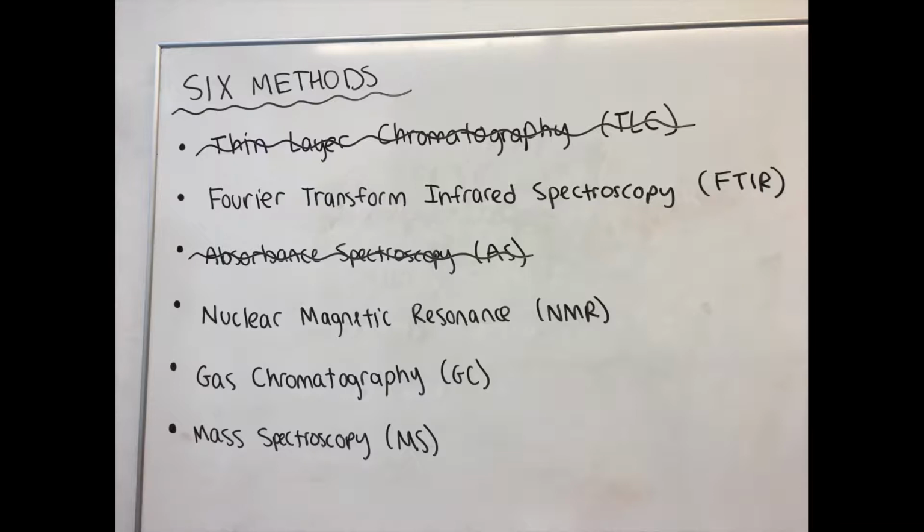AS is observed on an absorbance spectrum that shows the differentiating characteristics of the lambda max, or the wavelength at which molecules absorb the most photons. This can tell us how much and what types of electromagnetic radiation are absorbed because each substance generally has its own specific lambda max. It also is more quantitative than FTIR because it distinguishes between the lambda maxes of multiple substances within a mixture. However, we did not use this method for identification because we were not concerned with what wavelengths are absorbed by our substance, as this would not help in determining the structure of our molecule. Once again, we also already knew that we had a pure substance, so there's no need to distinguish between lambda maxes.